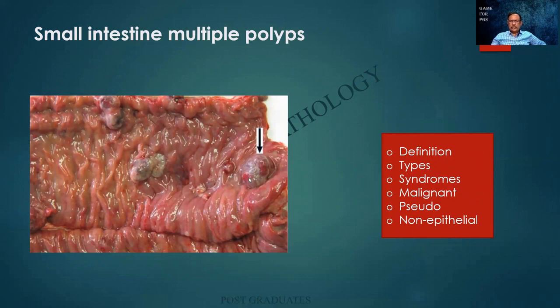I had taken a class on these polyps also. This, I would say that it's more or less benign, but then this patient happens to be having a mucosa carpeted with polyps. And when it grows larger and when it's going to become more variegated, there are blackish areas, red areas, etc., more prone. And it has to be followed up, biopsied and studied.